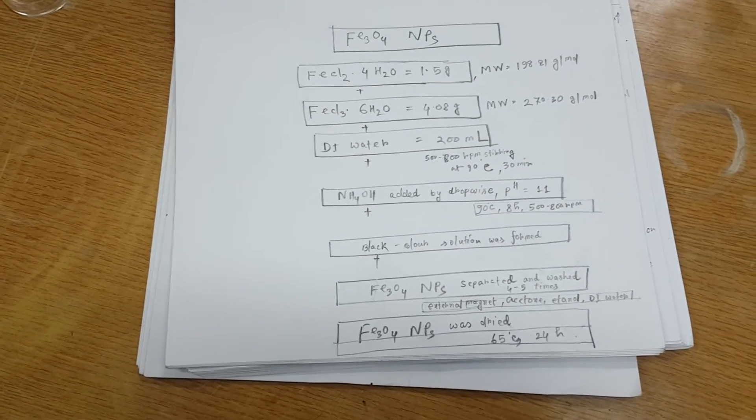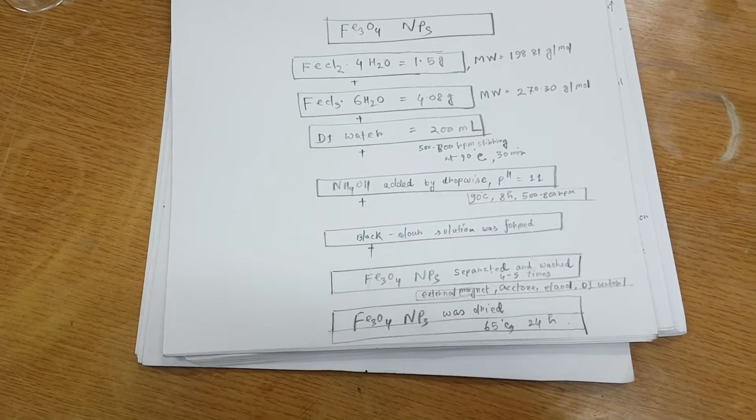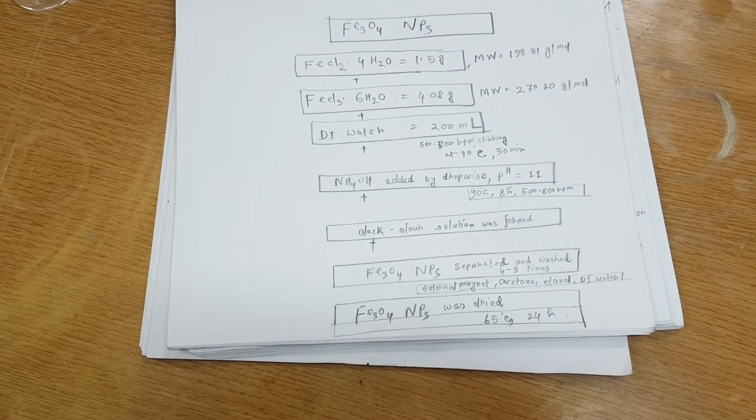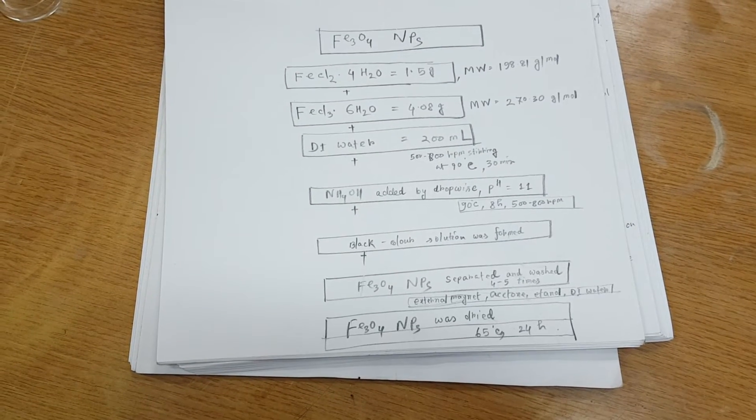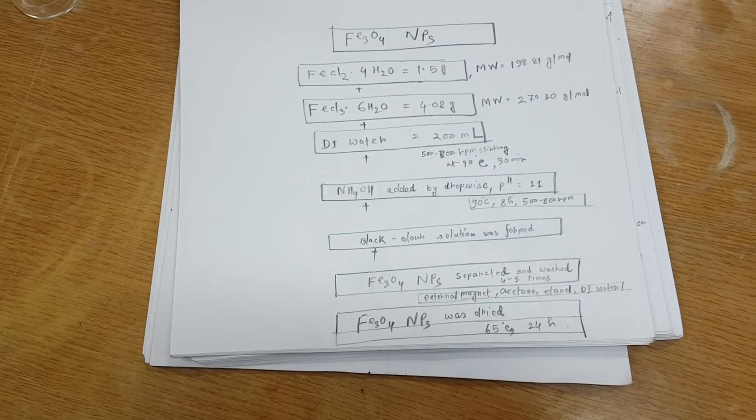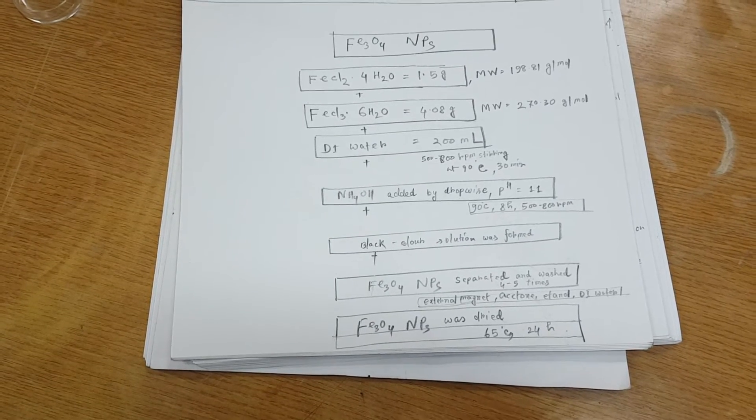At that time, dark solution was formed. And after that, the iron oxide nanoparticles was separated by the external magnet and then it is followed by the washing and cleaning by ethanol and acetone and then DI water.